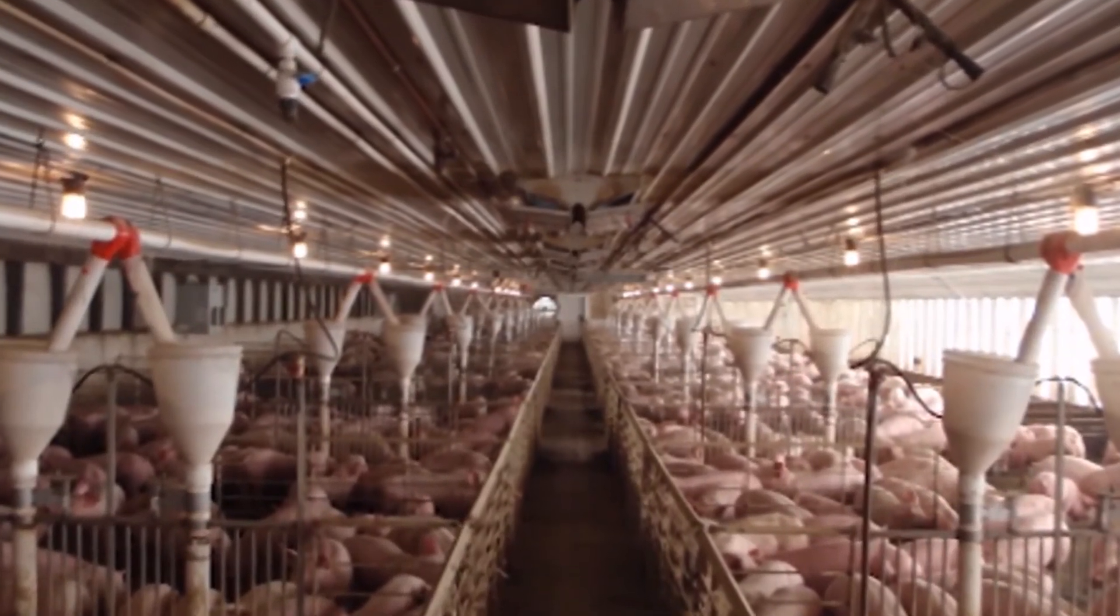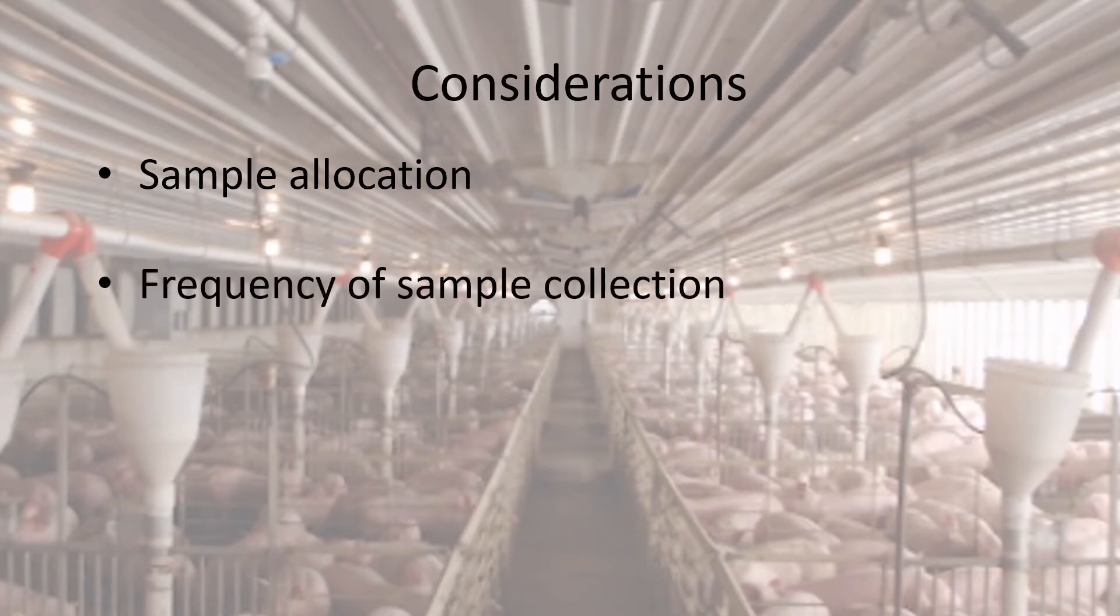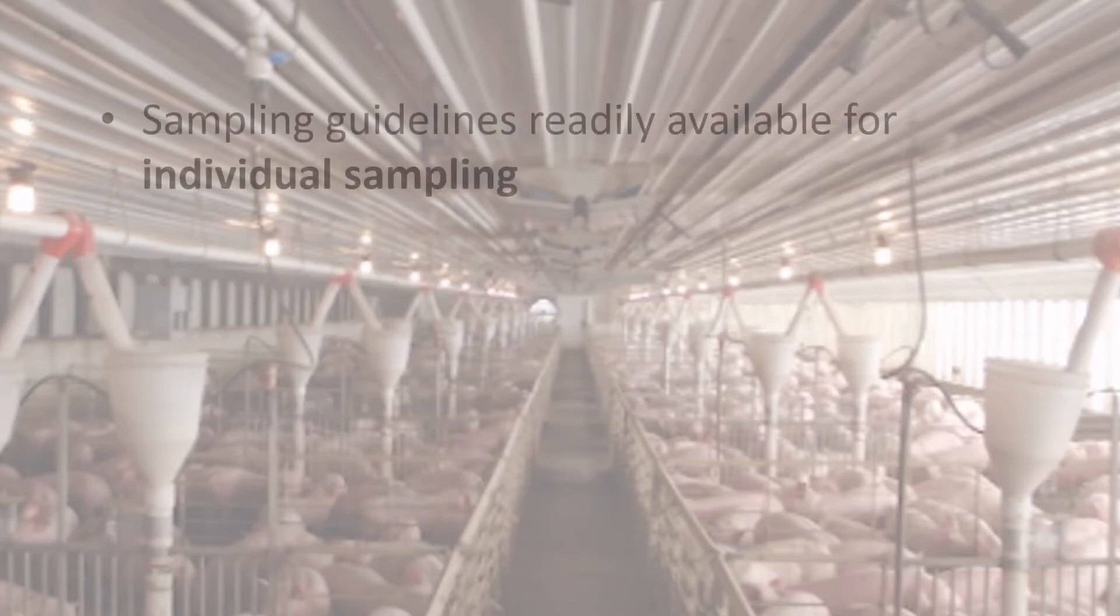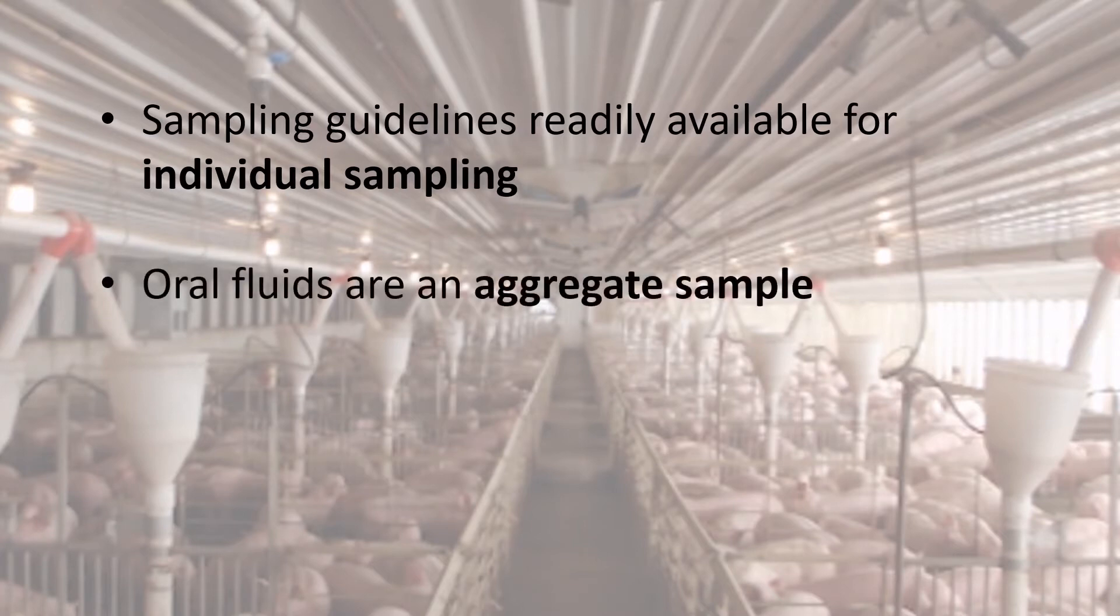When planning to collect oral fluids, it is important to refer to guidelines that help determine the pattern of rope placement within a barn, frequency of sample collection, and the number of ropes that should be hung within a swine operation. Many sampling guidelines are available for individual sampling methods, such as blood draws and nasal swabs. But oral fluids are an aggregate sample, meaning one sample contains oral fluid from many pigs within a pen. Therefore, different sampling guidelines must be used.